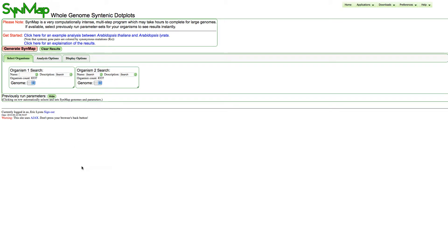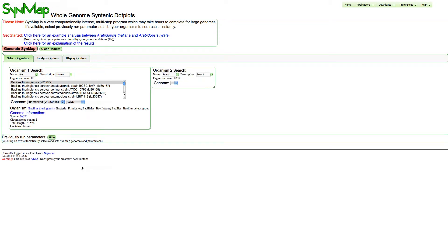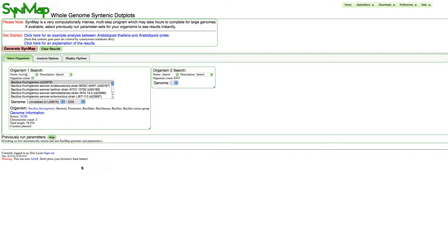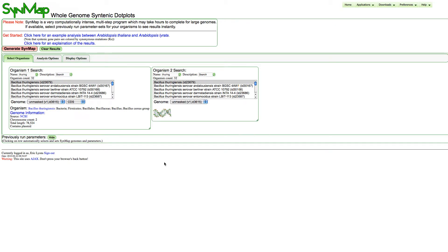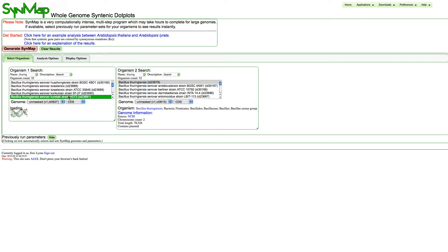We're going to search for thuringiensis by typing in part of its name. Once it searches in one box, I'll copy and paste that over to the second organism search box, and then select two of the genomes.